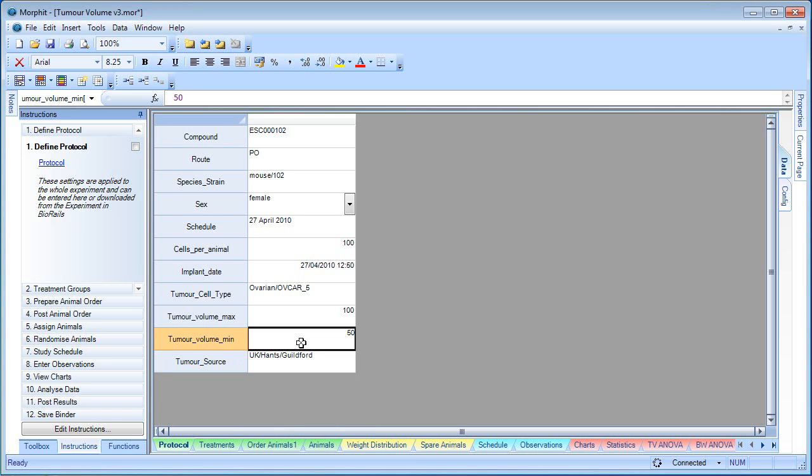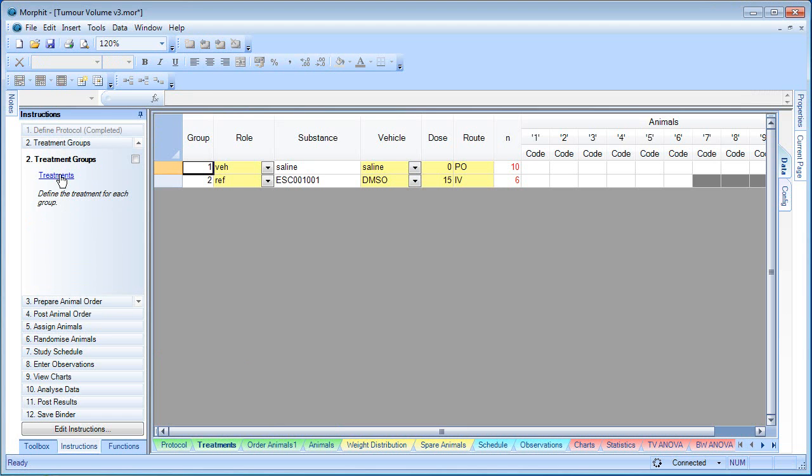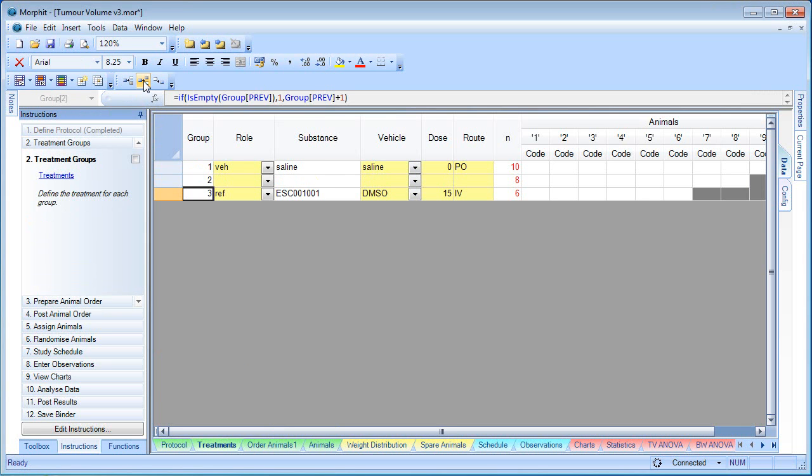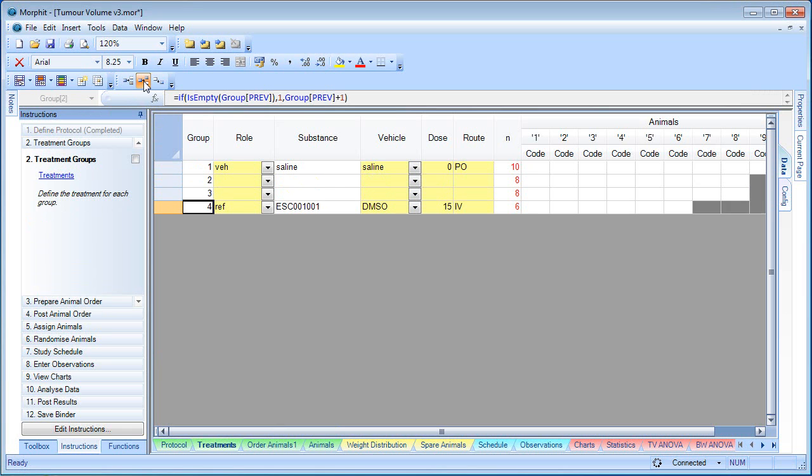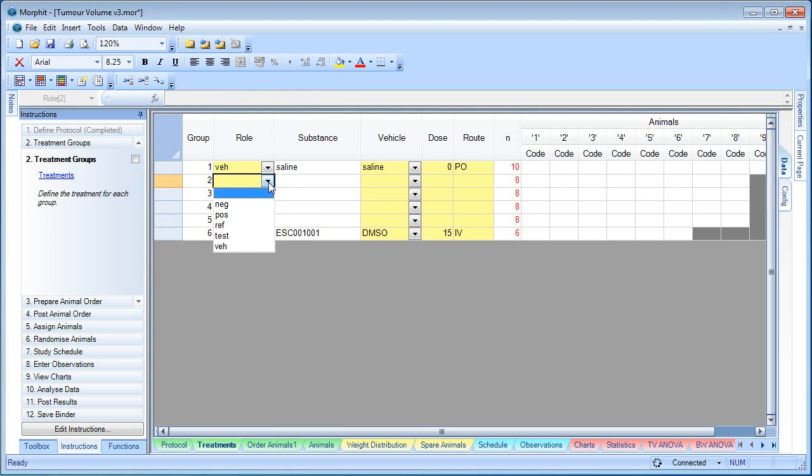So that's the protocol filled out. We can mark that as completed. And we can now set up our treatment groups. By default, we have two treatment groups in there already, and we're going to add four more groups for the test. We'll select the role.